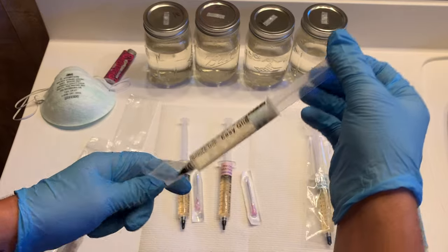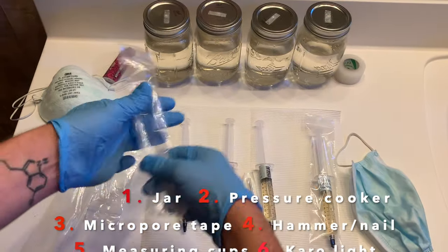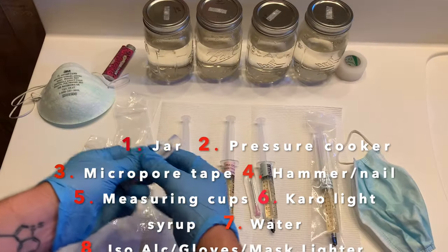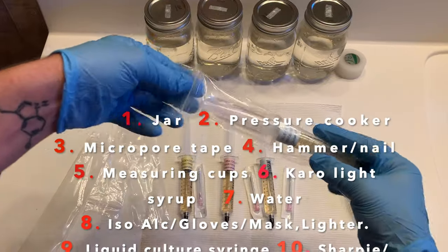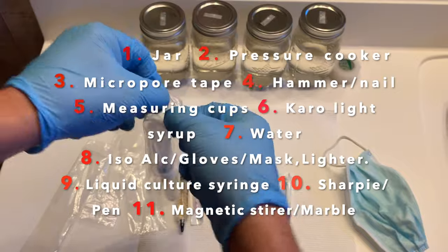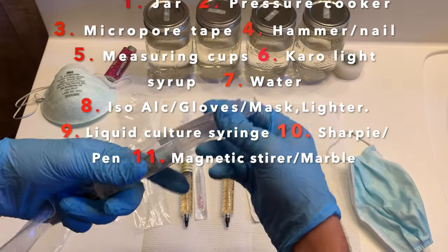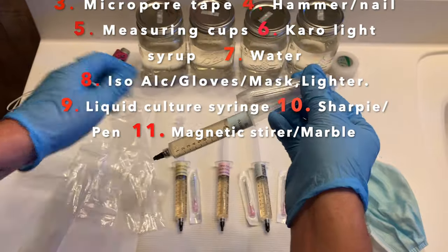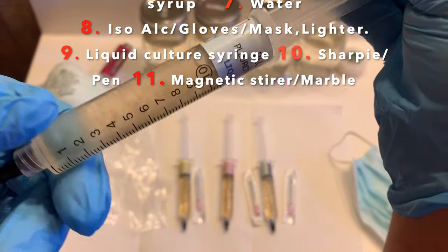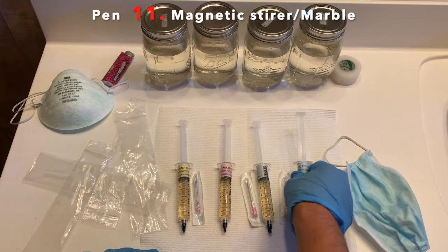For this method you're going to need a few items: a jar, a pressure cooker or a canner, micropore tape, a hammer and nail, measuring cups, Karo light syrup, water, isopropyl alcohol, gloves, mask, and a lighter, a liquid culture syringe from sporeandsprout.com, a sharpie and pen, and a magnetic stirrer or a marble.